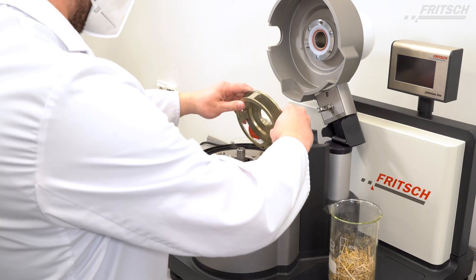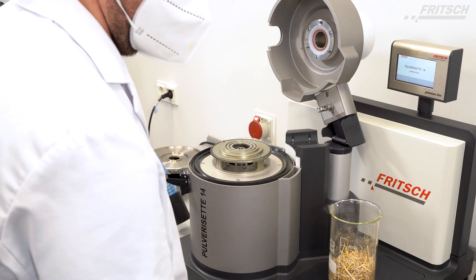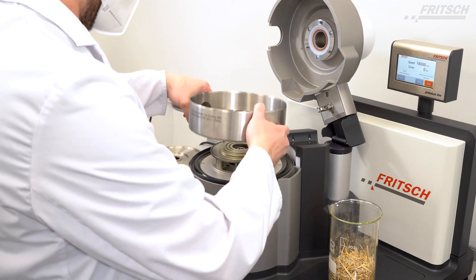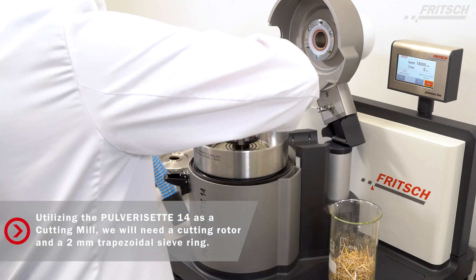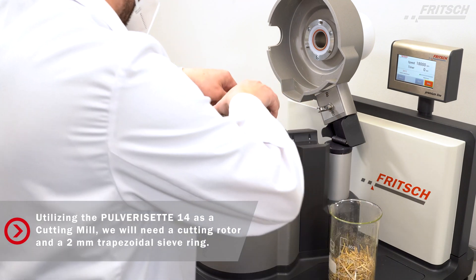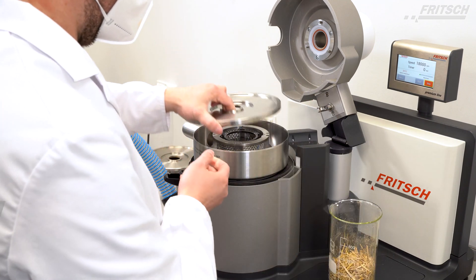To turn the variable speed rotor mill into a cutting mill, simply insert a labyrinth disc, a collecting vessel, a cutting rotor with cooling fins, a sieve shell holder with fixed knives and sieve shells, as well as the lid of the collecting vessel.